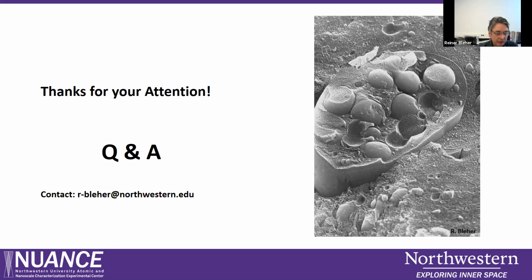But as I mentioned, if you want to do immunolabeling, you have to do everything to retain the hydrate shell around proteins and to avoid denaturing steps. That is why, in this case, you would want to keep the sample always at very low temperature, and you would use a low temperature resin for embedment of the samples.